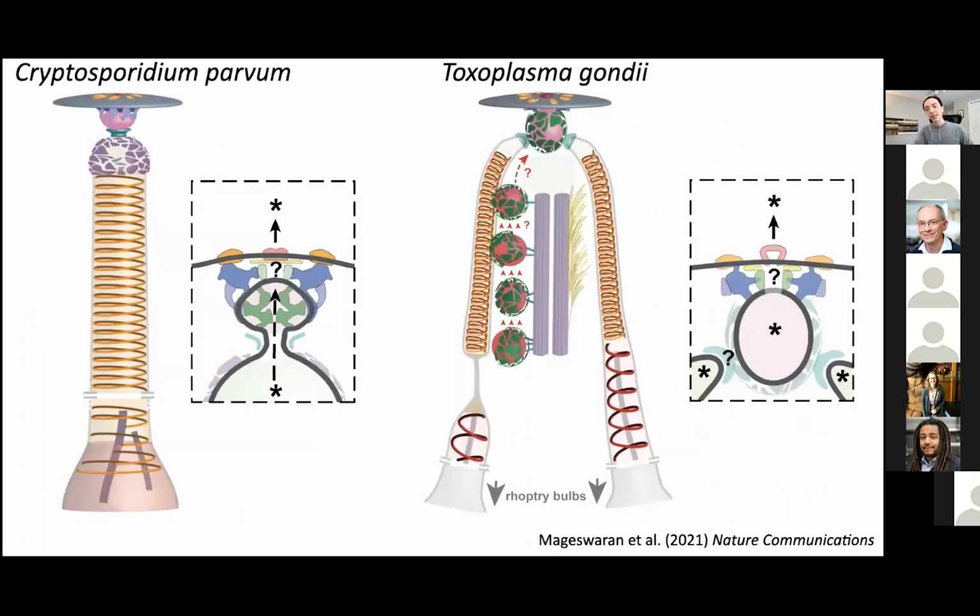Together, these observations we got in Toxoplasma gondii tomograms allow us to reveal a conserved molecular machine likely guiding the secretion of rhoptries. But in addition, this organism likely evolved additional add-ons for sequential secretion of multiple rhoptries. And this observation is actually consistent with other EM studies of other types of Apicomplexan parasites.